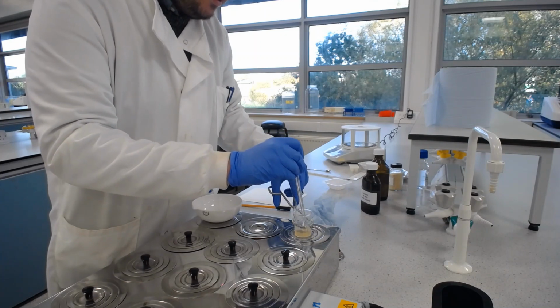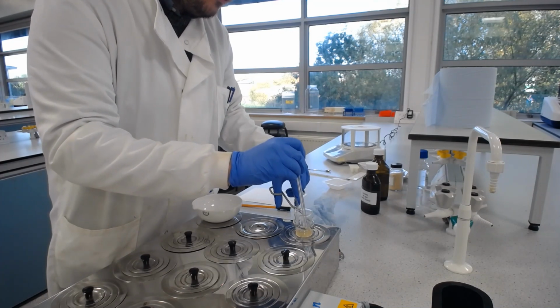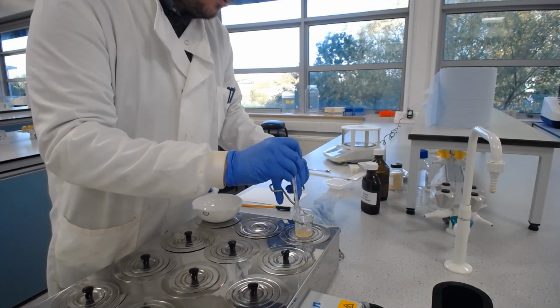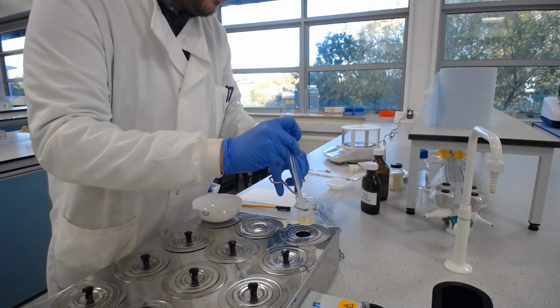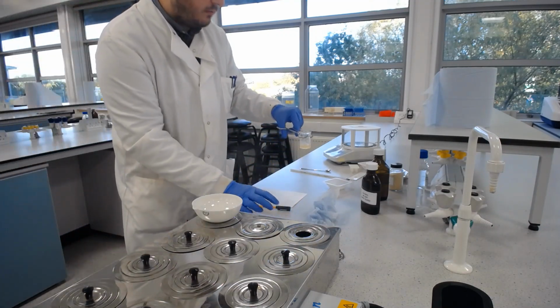And what we're doing when it's heated up is we're breaking those cross-links so they can flow freely over each other, giving enough energy into the system for them to flow freely over each other. But when we cool it down, we're removing energy from the system. So there's not enough energy to break those interchain bonds, and they can cross-link with each other again using intermolecular forces like hydrogen bonding, and form a network with which the gel will form.